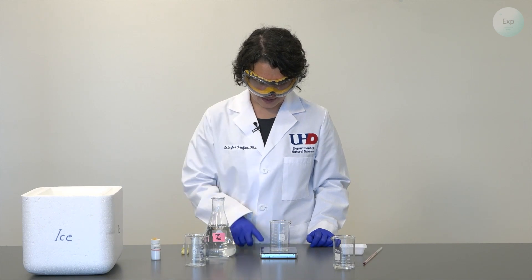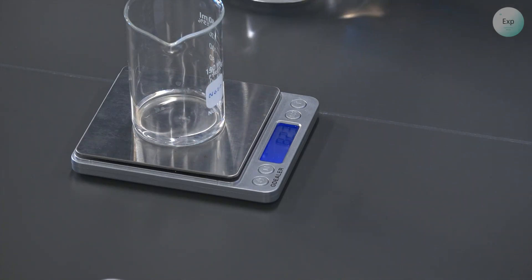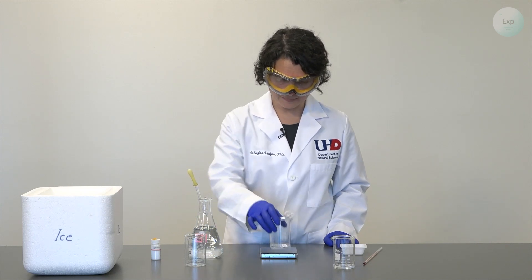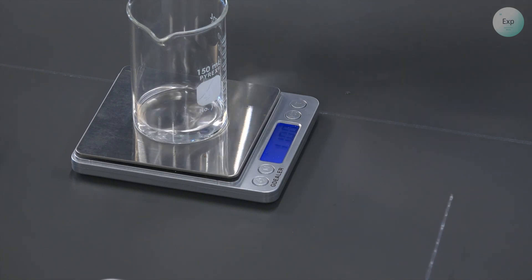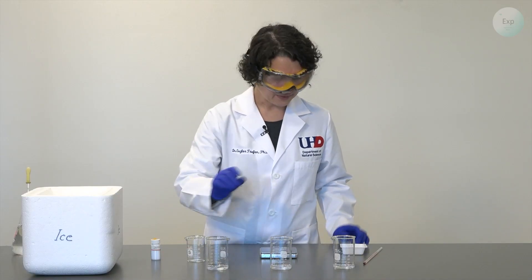Now I place my second beaker on the scale, tare it, and measure out another 10 grams of water. When I get close, I transition to the use of the pipette. And I measured out another exactly 10.00 grams of water. I will do the same thing for my third beaker — I will tare it first, then pour the water. If it is more than 10 grams, I can extract it and transfer it into a waste container. And with that, I have all three beakers with 10 grams of water each.